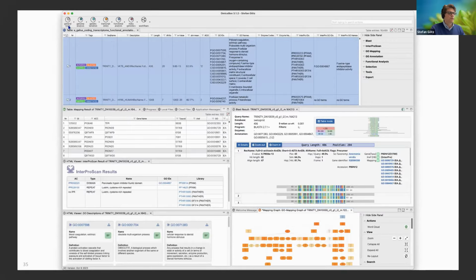So you always have, just for those who have never seen OmicsBox before, a quick introduction. So you always have your modules over here, with all the different options. Then you have your table. Each analysis step, like count table, pairwise differential expression, enrichment analysis, pathway analysis, all those give different tables with different tabs and different columns.